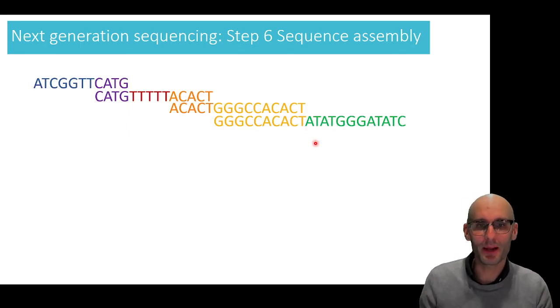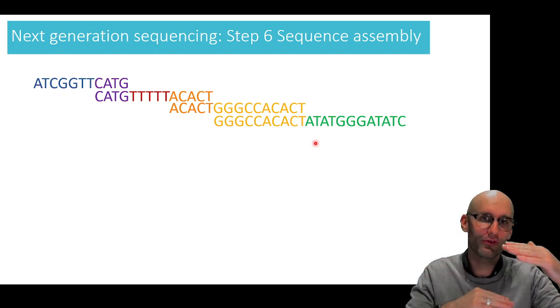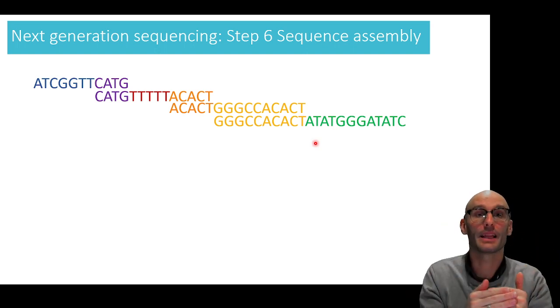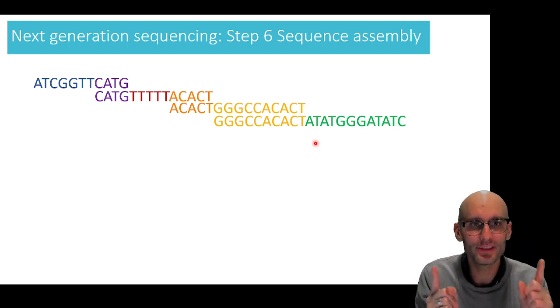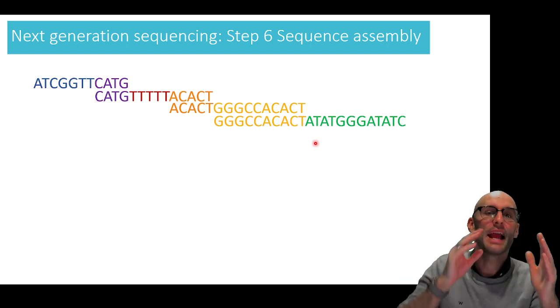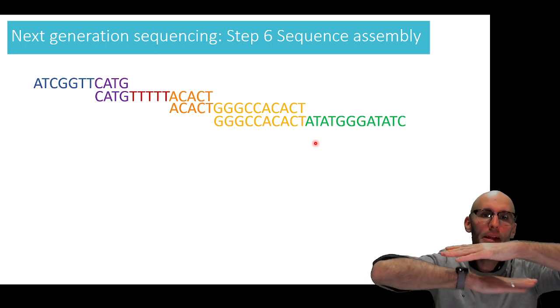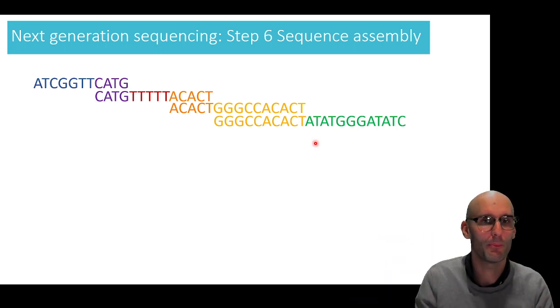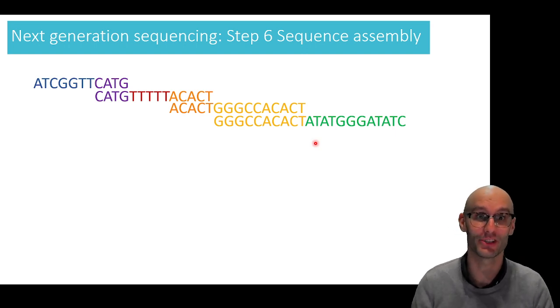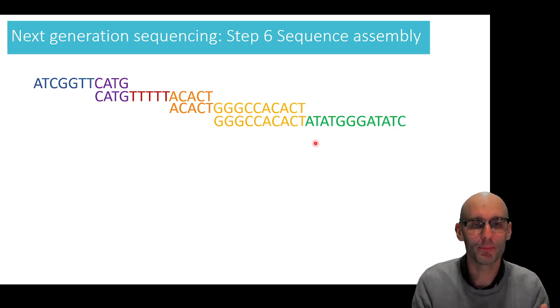So now you get your fragments, how do you turn this into a full piece of DNA? Well, you assemble your fragments by looking for the overlapping regions of it. You haven't put one strand of DNA in, you've put a lot of strands of DNA in, all overlapping, and they will all fragment at random at different locations. So now when you sequence your fragments, they're all going to be overlapping and you can build it up like a puzzle piece. Now, computer advancement has really helped next generation sequencing. Now we can use computers to very quickly assemble our sequence.